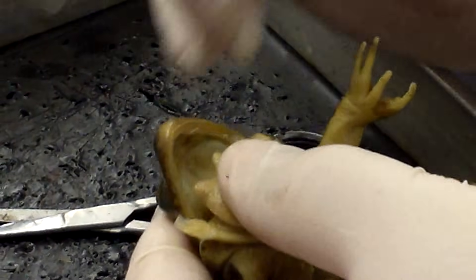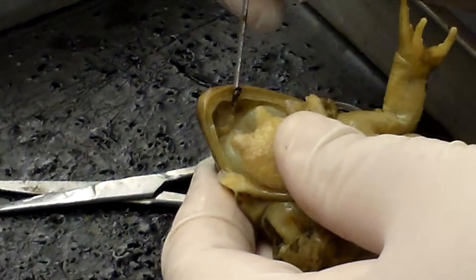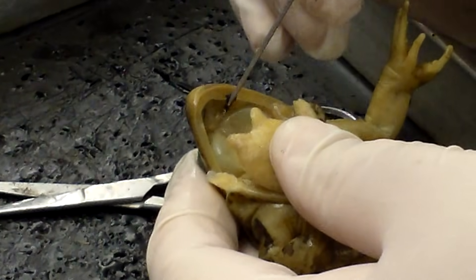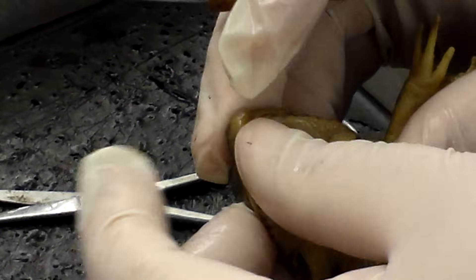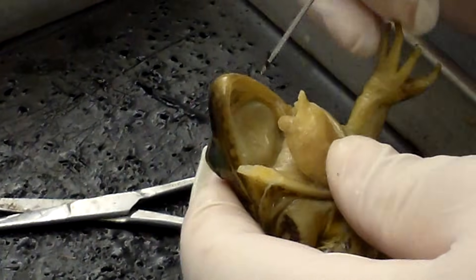They also have two specialized teeth called vomerine teeth. There are two white dots there and if you feel them, they look and feel like teeth. These are for crushing prey — when they get an insect in their mouth, they'll get it inside and then crush the exoskeleton by closing their mouth and pushing it against the vomerine teeth.